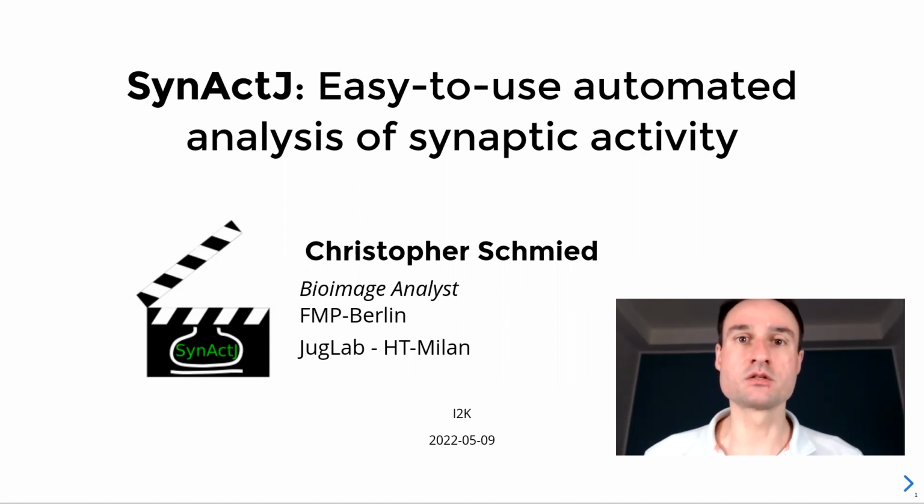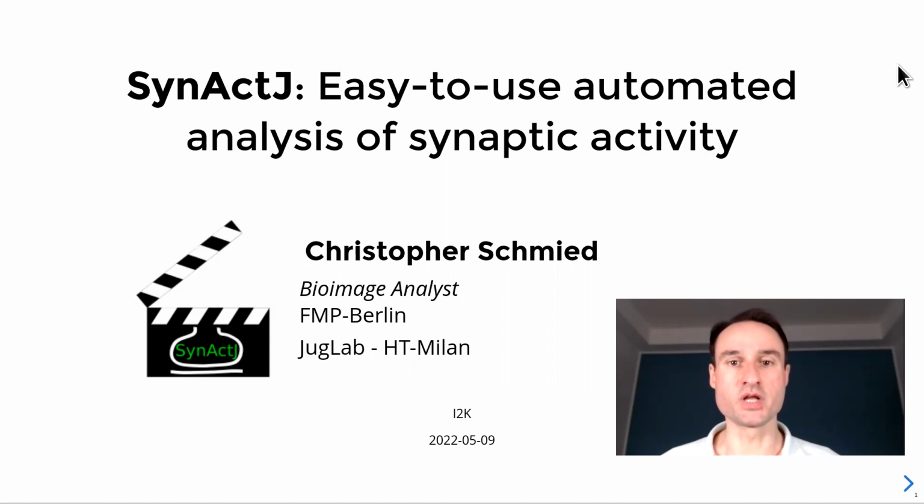Today, I would like to present the work I did at the FMP in Berlin developing SynActJ, an easy-to-use, automated analysis of synaptic activity.